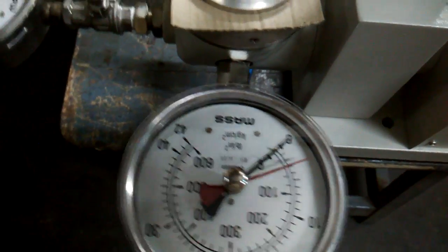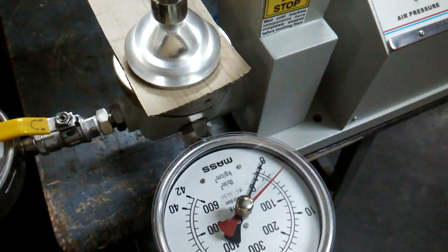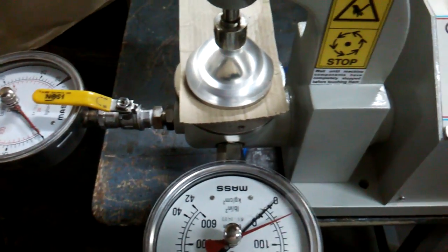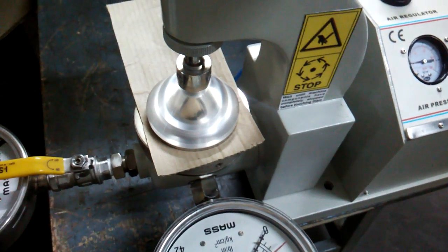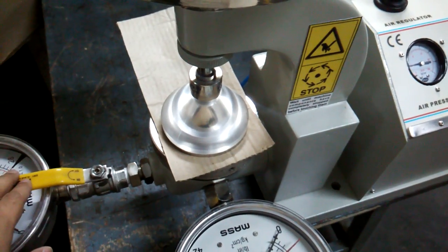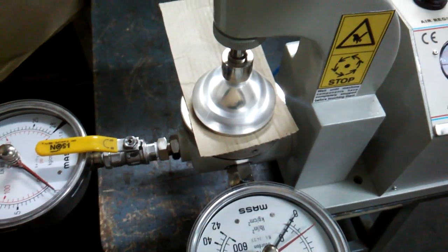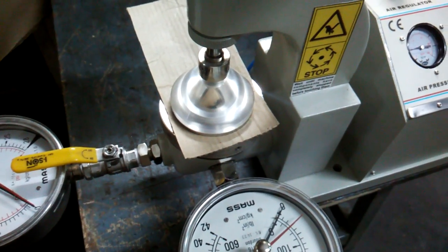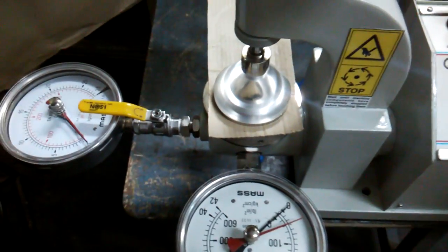You can see it's near about 3 kg per centimeter square, or 40 psi. If we have to check the pressure of the bursting up to 20 kg or 400 psi, then we can switch on or open this valve to check the bursting strength on the 400 psi gauge.